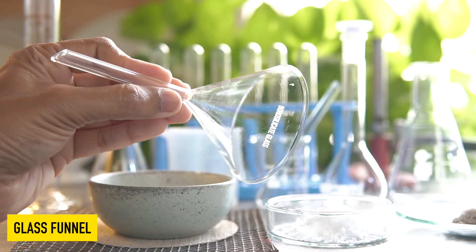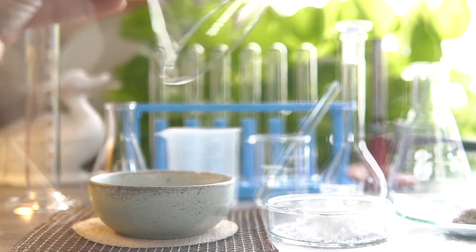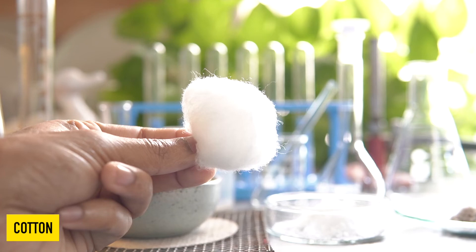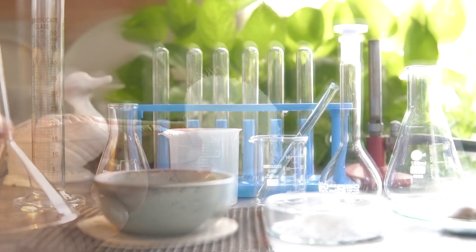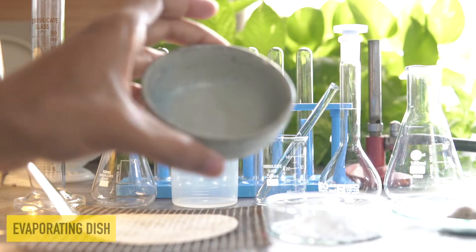The apparatus we need are a glass funnel, some amount of cotton, and an evaporating dish.